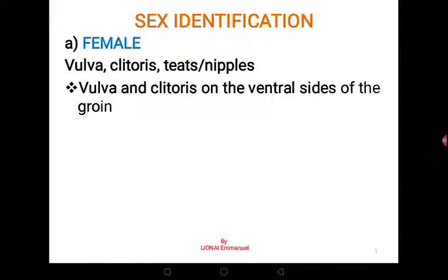We only have two sexes — male and female — for the rats. If it is a female, these are the structures you would expect to see externally. Starting with external features you can easily use to recognize the sex: if it is a female, you should be able to see the vulva and the clitoris, which constitute the external genitalia. You should also be able to see the tits or nipples.